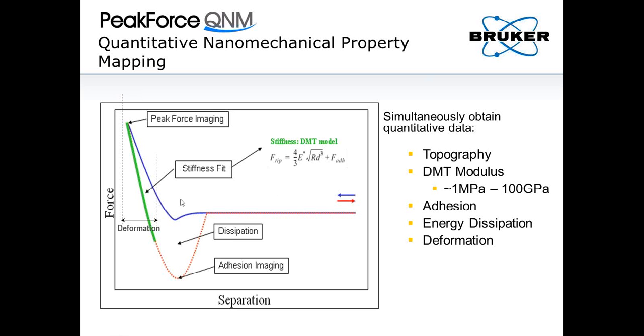For example, you can see how much the tip is deforming the sample, how much deformation the tip causes the sample. And that tells you how hard the sample is.